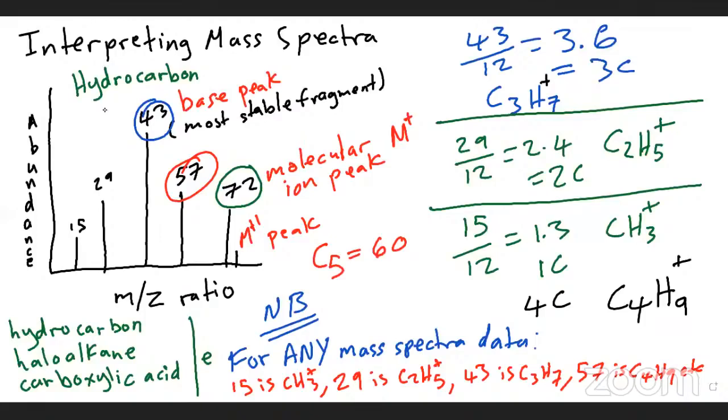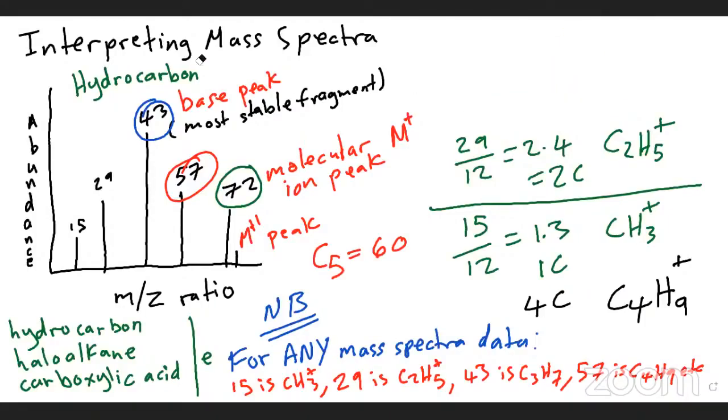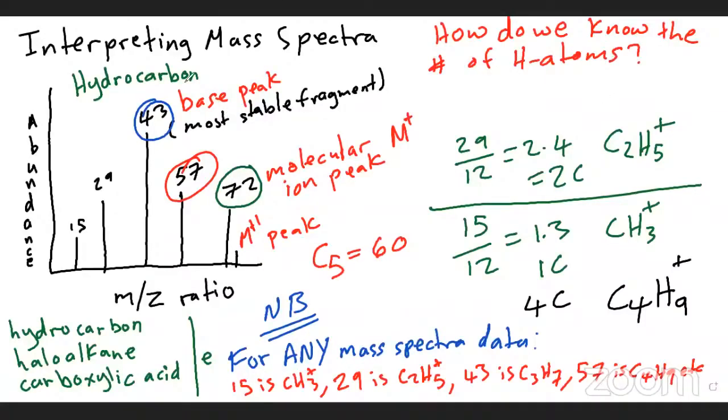Let me just put the question on the board for you. Yes, a plus should be on the molecular ion as well.